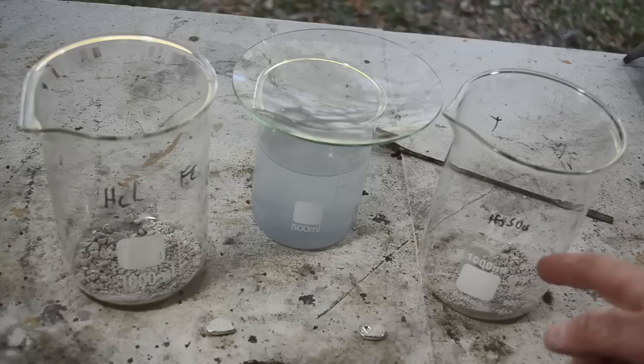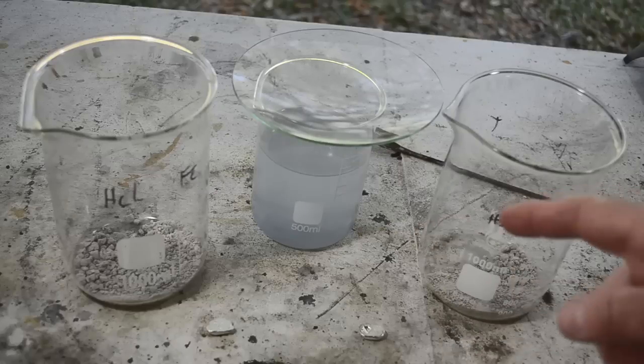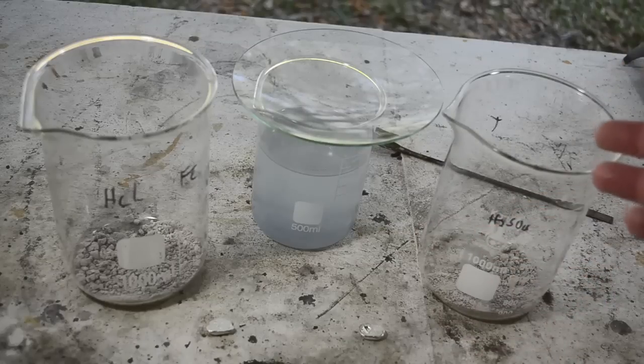It gets something out of the silver, and it doesn't dissolve that much silver, but it does dissolve some. So is it worth the loss? Especially if you're doing this on a large scale. I don't know.